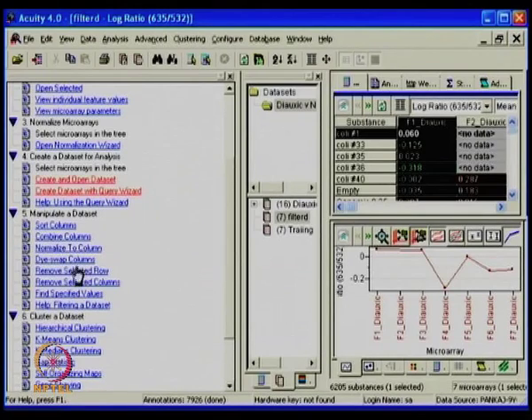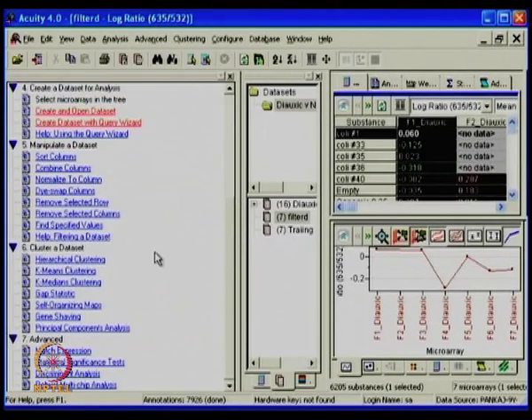And then many times you find that there are a few rows I want to remove, I can remove a few rows, I can select a few of the columns and remove them. Say for example, some QC has not passed. So I can just remove them, which can allow me to do it in different ways. And then once you have done that, you can go and do a clustering, which is a visualization method.